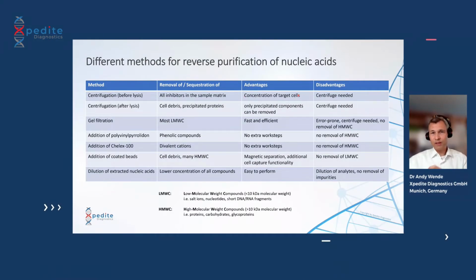The disadvantage of that is you need a centrifuge. Especially if you think about point-of-care diagnostics, or applying these methods in laboratories or even not labs, but other places, mostly there's no centrifuge or you don't want to use a centrifuge there.